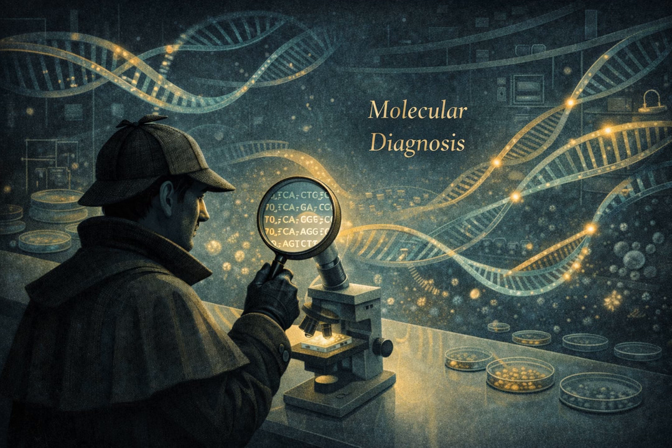You can. And this brings us to the big exam point that both Murray and Joetz emphasize. Why is real-time PCR so much better and safer for the laboratory environment? It has to be because you don't open the tube. It's a closed system. You never, ever open the tube after you start the reaction. In the old gel-based days, when you opened those tubes, you were releasing a cloud, an aerosol, of billions of microscopic DNA fragments, we call them amplicons, into the air.